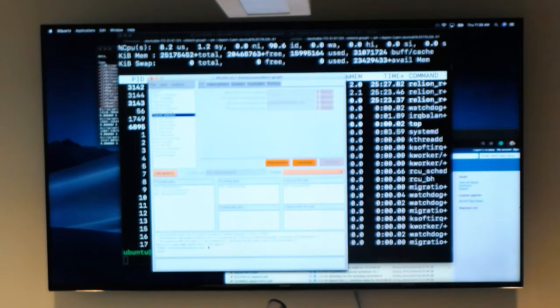There are no duplicates. What happens if you add a lot of the same particle multiple times? Well, in that case, a particle correlates with itself really well. So when you do some of the validation techniques, you'll notice very odd correlations because an FSC is a validation technique for similarity.